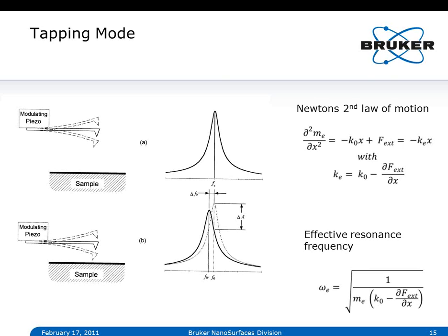So that's one thing to take away here. When we do tapping mode, we don't look at a force per se. We're always dealing with a force derivative, so dF/dx, x being the distance here. When we come closer to the sample, that force basically changes our system. The stiffness changes, and we use an effective resonance frequency in this case to operate our feedback system.